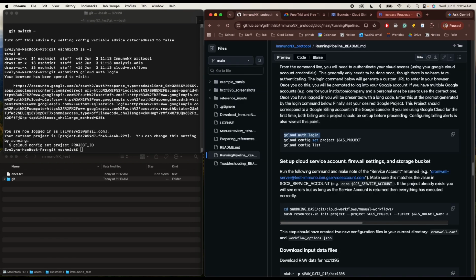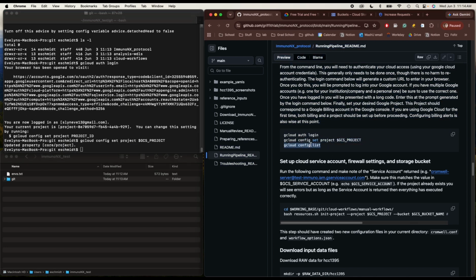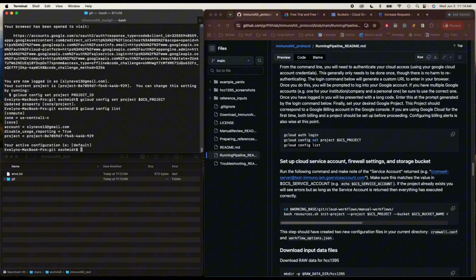Okay, we're authorized. And then we set our project, which we also already did. And then we can list our configurations. Yes, we're in the US Central Zone. This is my spam email. And then our project.